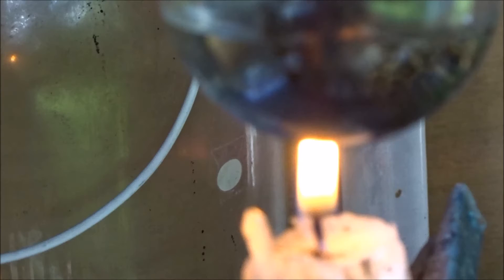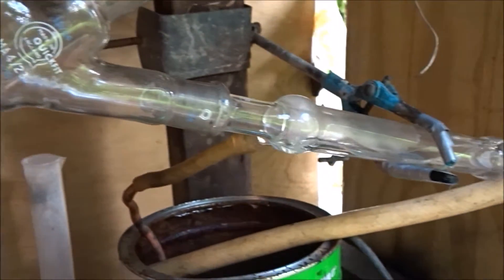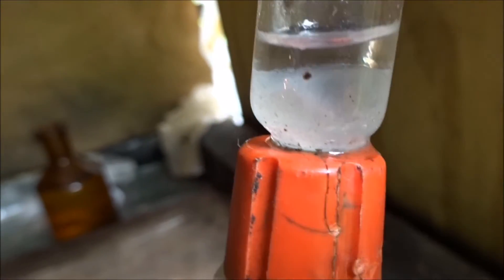The crude ethanol, which is about 40% water, is placed in the round bottom flask. This apparatus works by boiling the ethanol solution, and when it is condensed in the condenser and collects in the Dean-Stark trap, the water drops to the bottom and can be discarded.